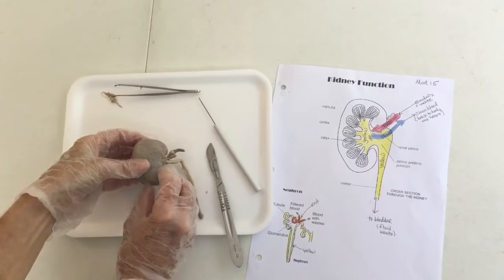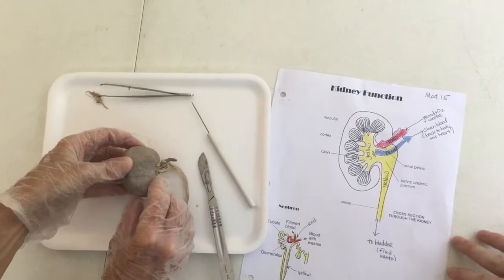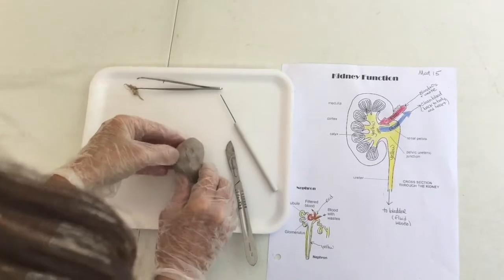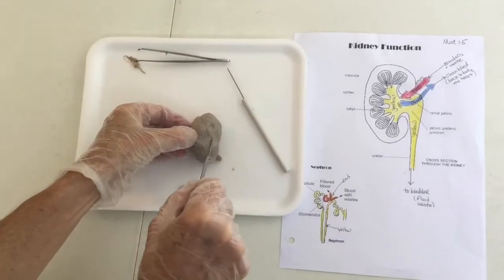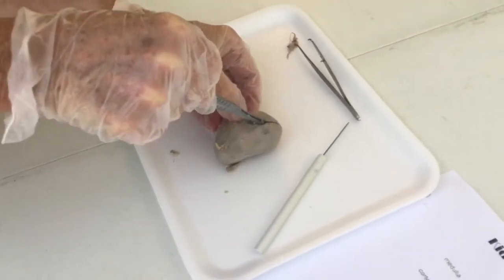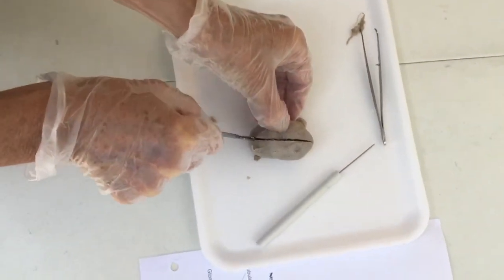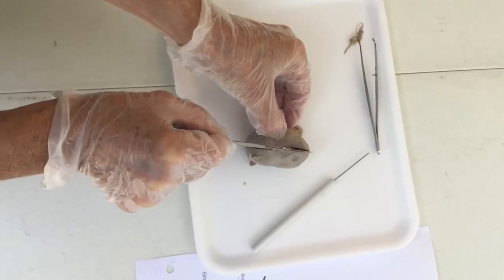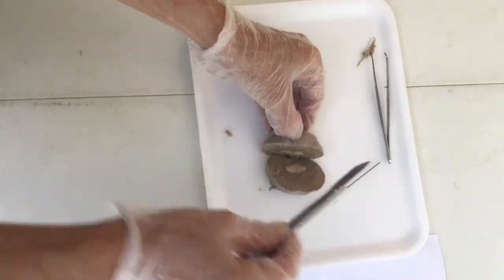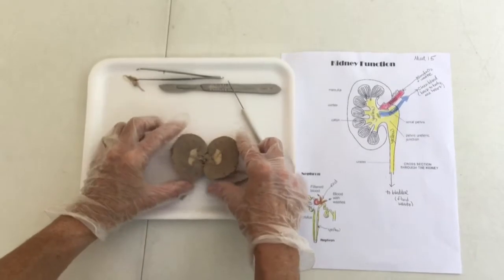All right, so this is a simple dissection in that we are just going to basically cut the kidney in half. So what I'd like for you to do, if you're cutting with me, is put all those vessels down on the plate, and carefully take your scalpel or sharp knife. It's not too hard to cut, and we're going to cut it gently down the center. If you watched the heart dissection, it's a lot like that in that we're just cutting it straight down. It doesn't take too much pressure, and we're going to open it like a book. Okay, so now we have our one kidney in two halves.